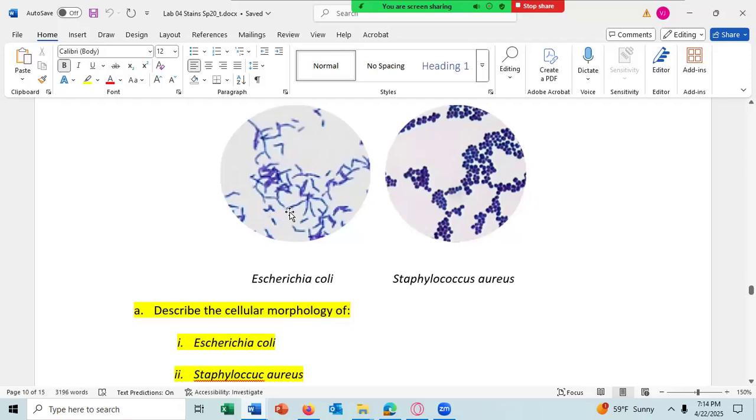And this was actually one there, one there, one there, and one there. So that's actually 4 cells together. That right there is 2 cells together. One there, maybe 3 cells. One there, and then one there. There's 2 cells together. So make sure you get the shape right here, because this is not a very good picture.